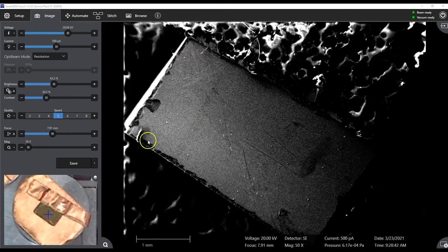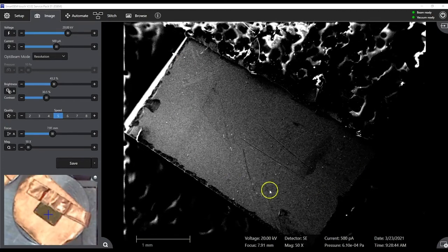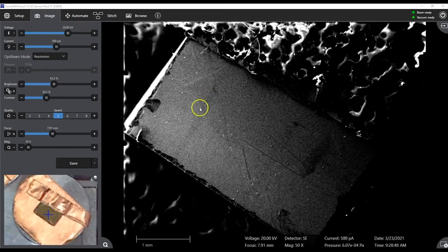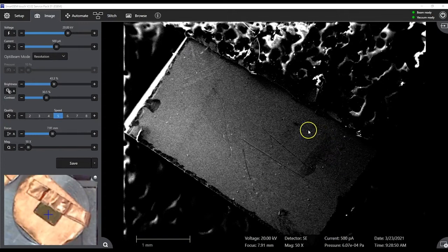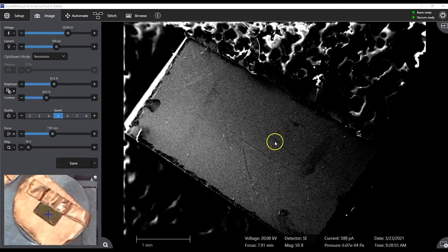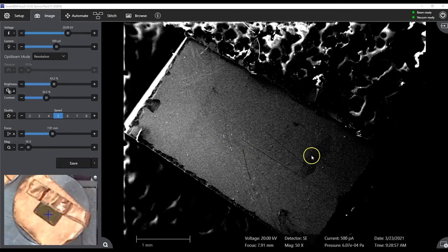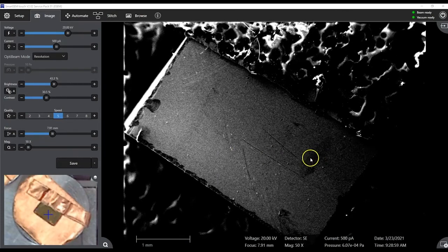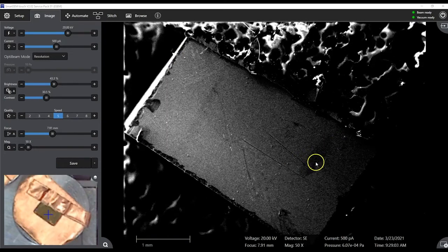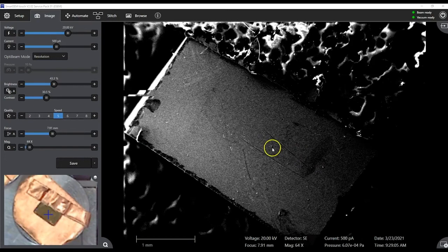These are gold chips that have been coated with biolinker molecule, lead, and then topped with gold nanoparticles. So what we're looking for are gold nanoparticle clusters with some sort of organic molecule. We put this chip under UV light to clean off contaminants. So now we're going to go ahead and zoom in.